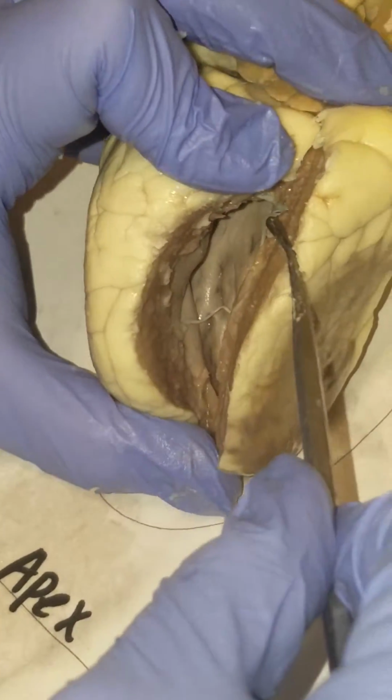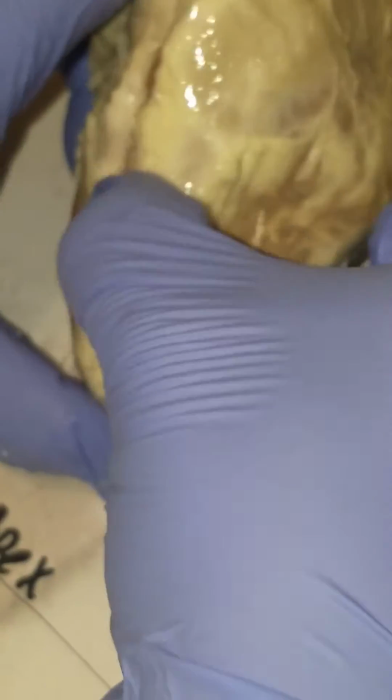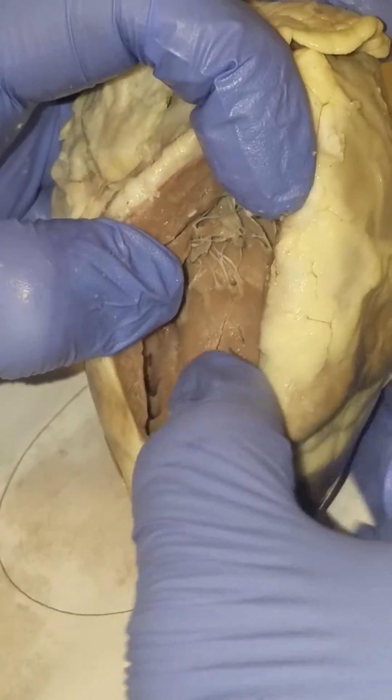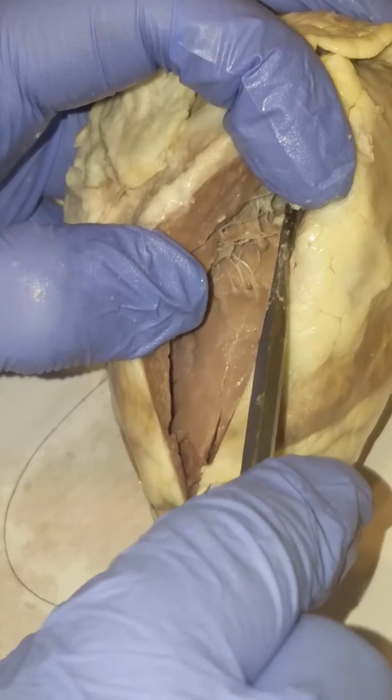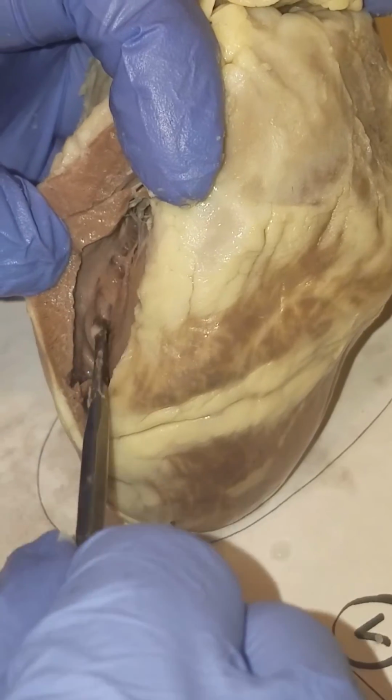The chordae tendineae are like these little hairs. They look like little hairs. Right in there, you see these. And the papillary muscle is the smooth area that you see in here.